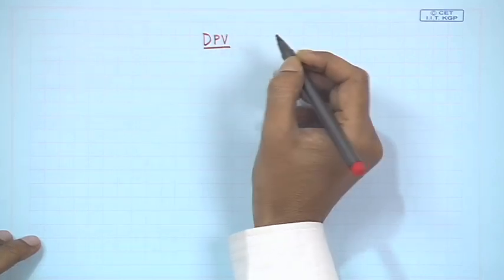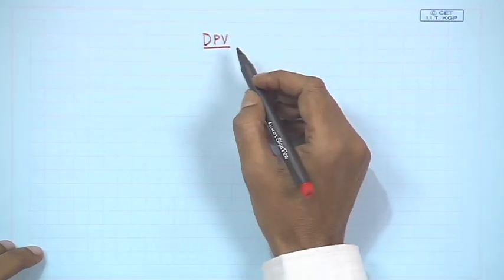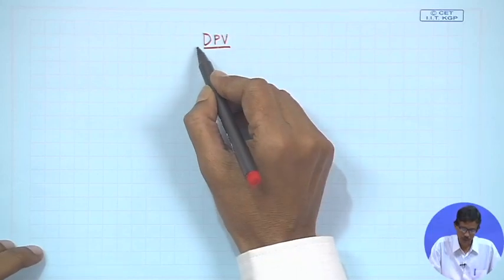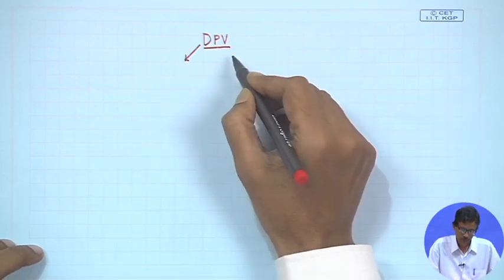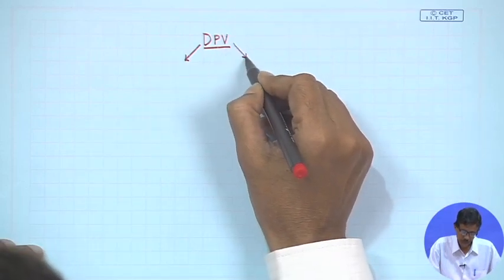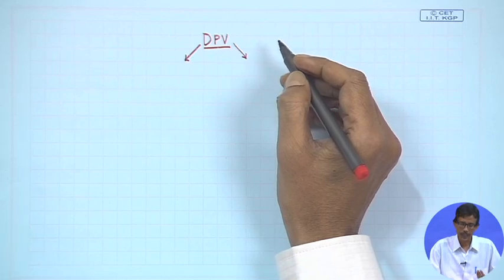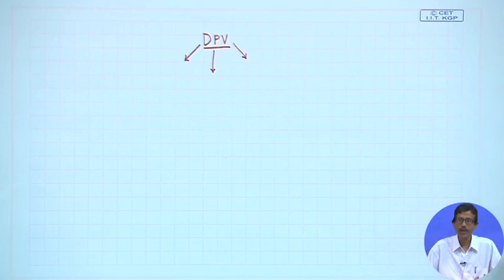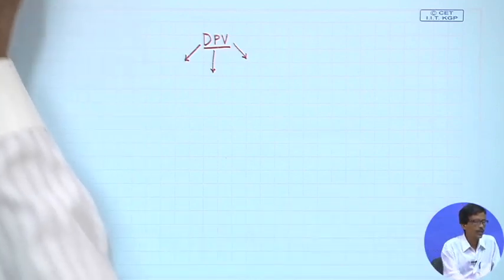Hello and welcome back to this class where we are talking about the differential technique, the DPV. As we have discussed, we can have different types of electrode modifications, which we will discuss just now. Before that, we can have the development from the electronics part to generate the pulses, and the computers to record those pulses as well as to deliver those pulses to the electrodes.